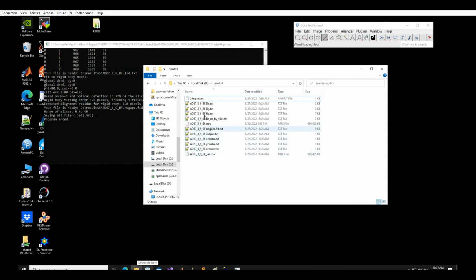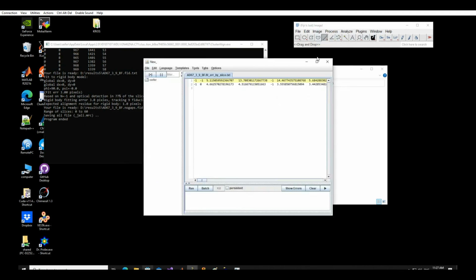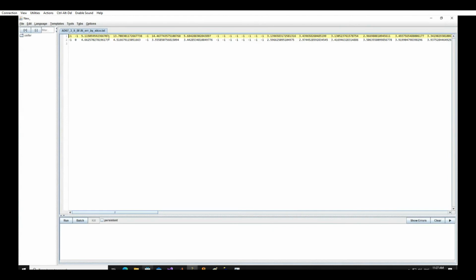The RMS deviation from rigid body rotation is indicated in the following text file. The values are ordered according to tilt series views. A -1 indicates that a reliable fiducial could not be found in a specific tilt view.